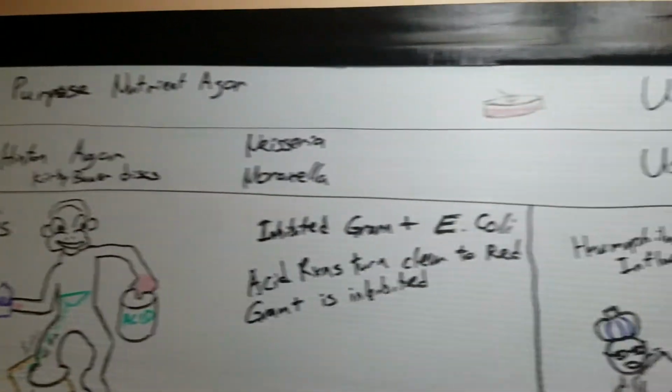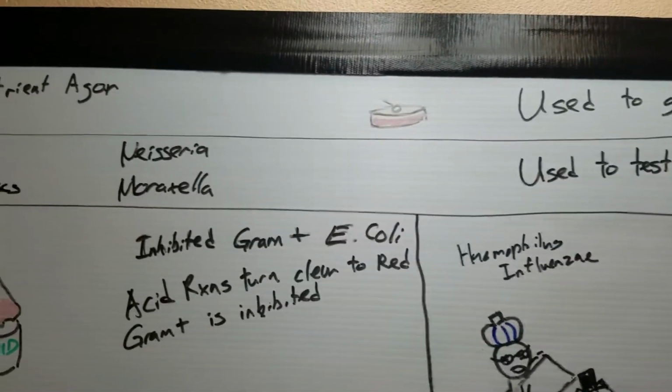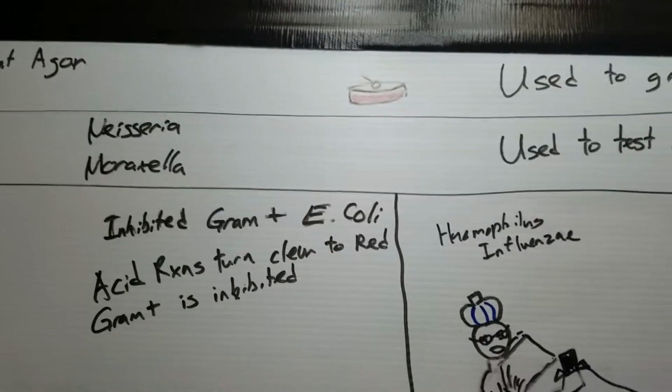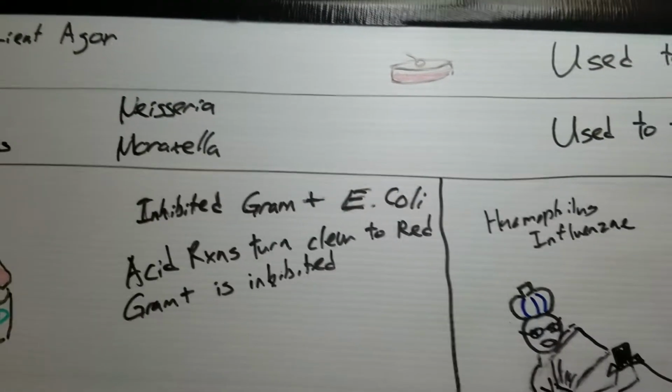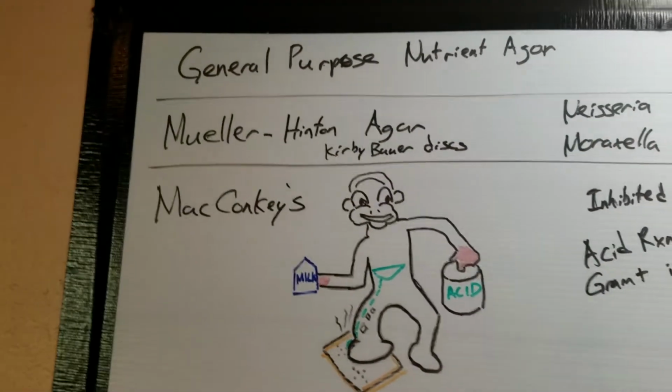So one way to think about that is you have your agar plate, you take it upside down, you shake it around a bit, nothing really comes out. And that's probably because the liquid gel that's in there moves slowly. So it's not fast. You get that? Okay. Pretty simple, easy way to remember it.